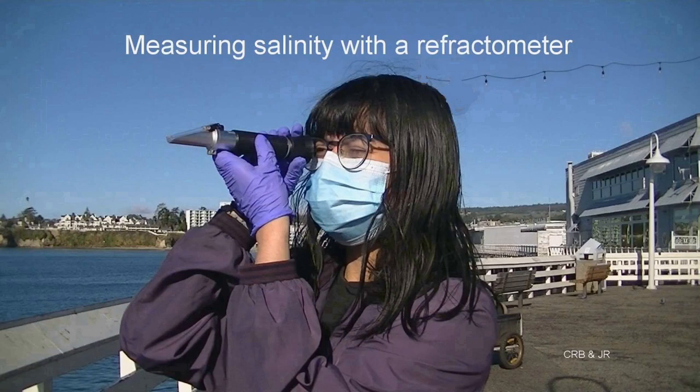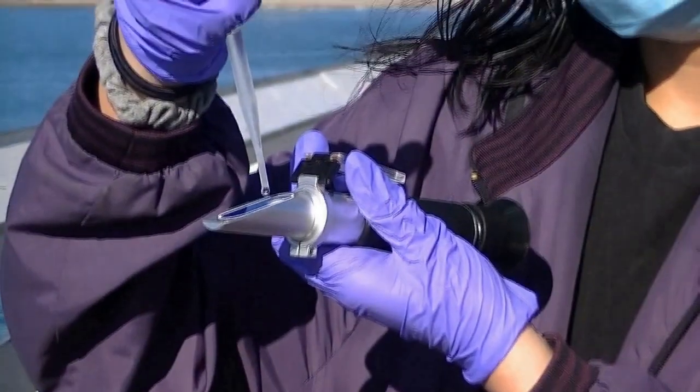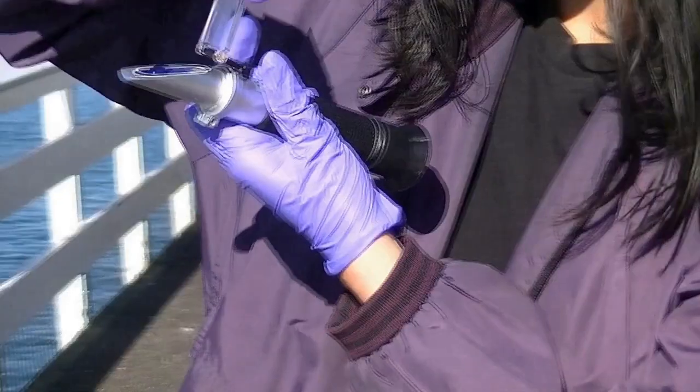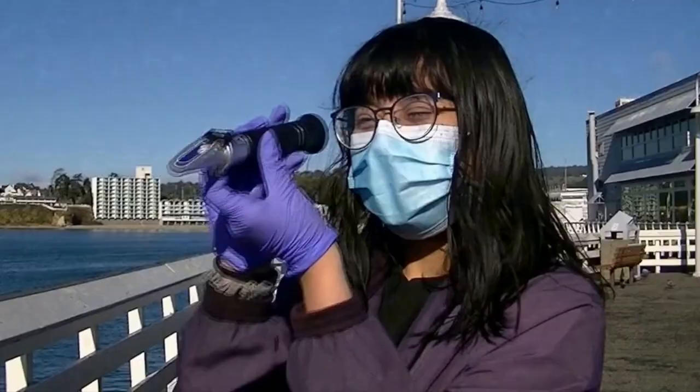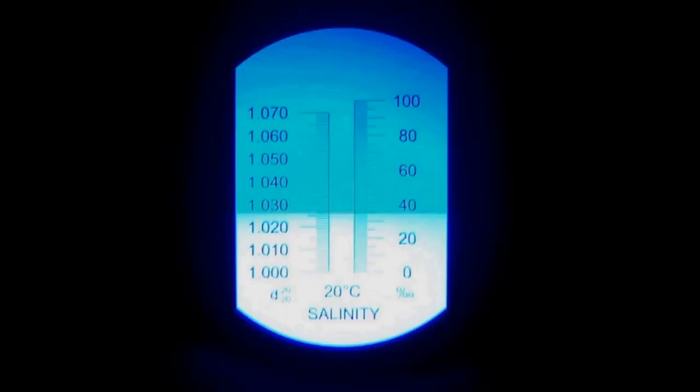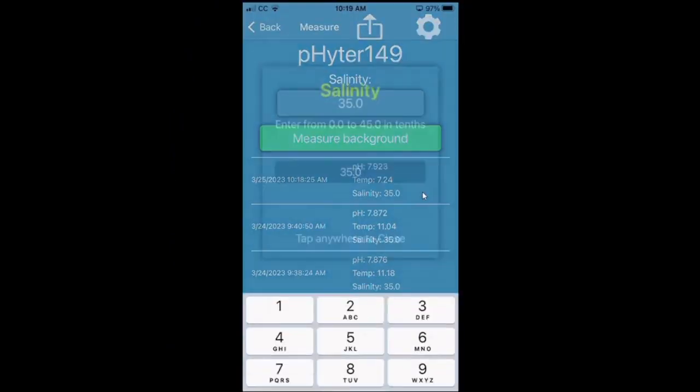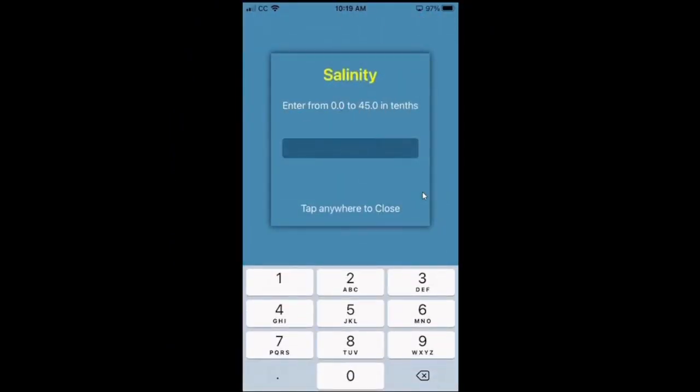Before measuring the pH, we need to check the salinity. Carefully pipette a drop of liquid. If required, you can change the salinity.